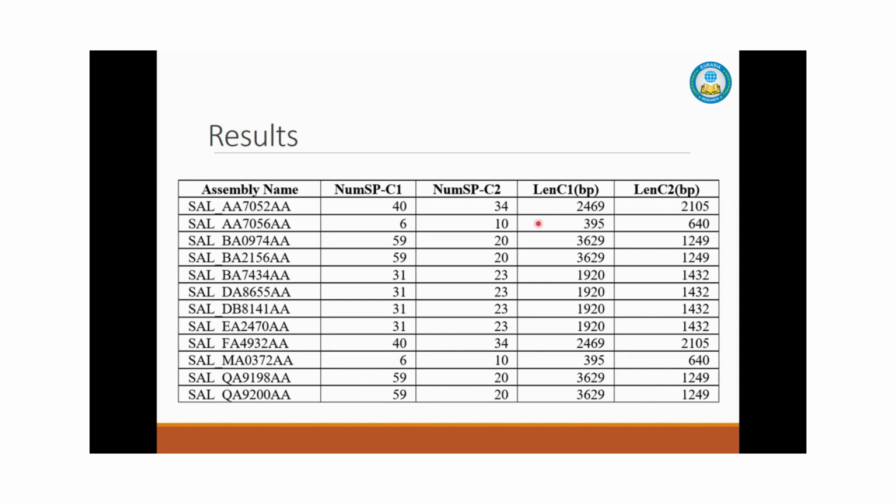CRISPR is like a tool for modern gene editing. If you want to do gene editing nowadays, professionals in bioinformatics first use the CRISPR tool to edit the genome anywhere we want. This is a quite powerful tool. But now we will show only this result.